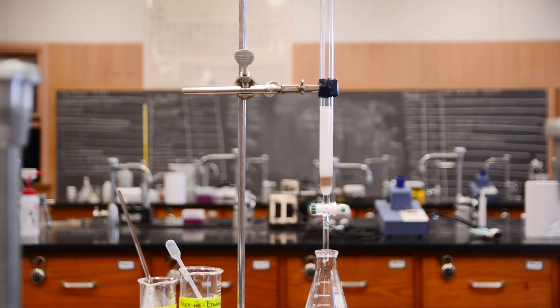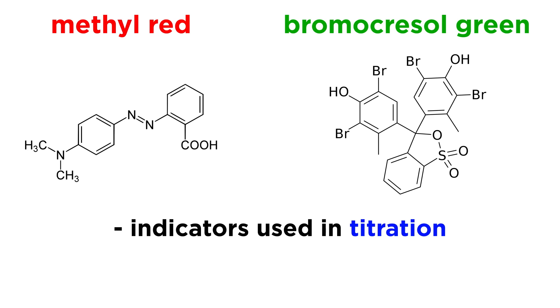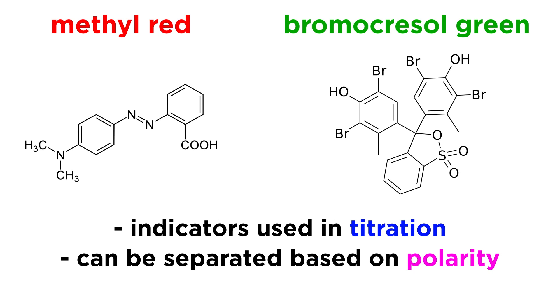We're now ready to load the sample. Today we're separating a mixture of methyl red and bromocresol green. You may know them as indicators that are used in titration, but if you look at their structures, you can see that they have different functional groups, which allows them to be separated based on their polarities.